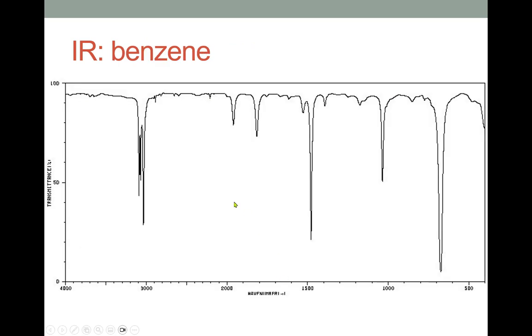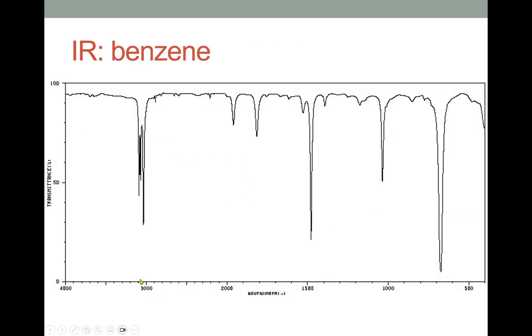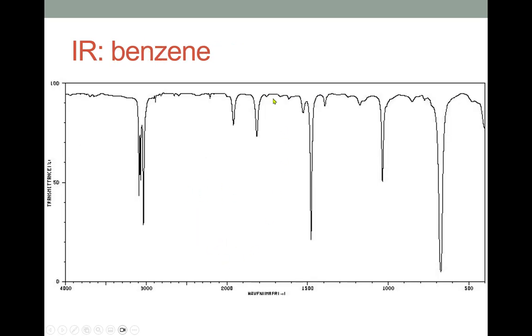If we look at an IR of just benzene, which is just the aromatic ring, maybe we can convince ourselves we see that CH bond right here, although you can already see a number of things happening to obscure this area. And then the other peaks for the aromatic ring carbons should be in the region of 1600 or so. It's kind of what we're seeing through here. So a collection of small peaks, again, not very useful, but you'll hear them described as aromatic overtones.